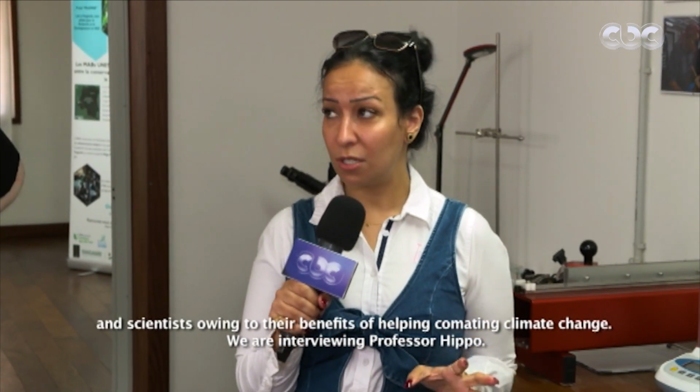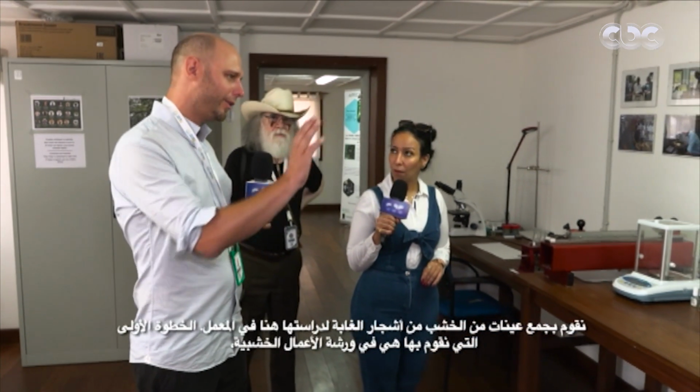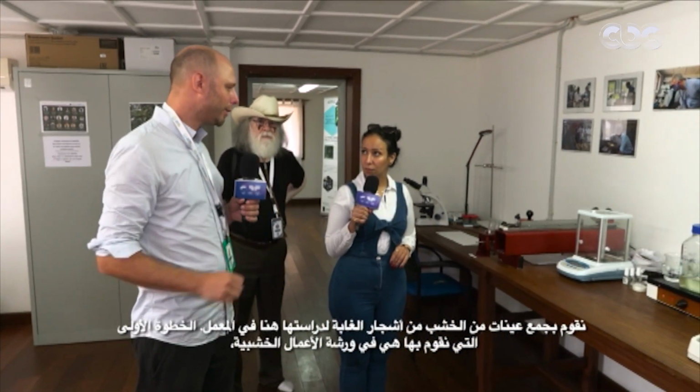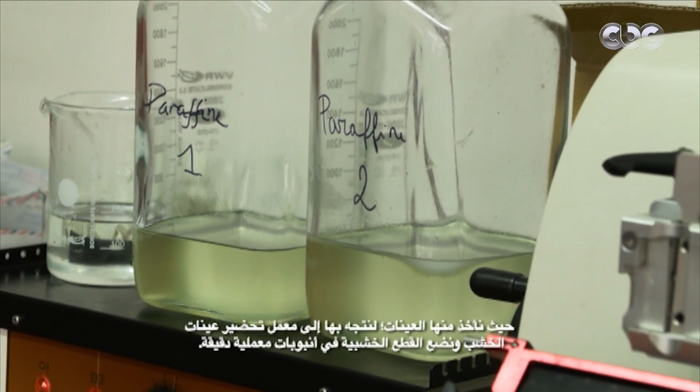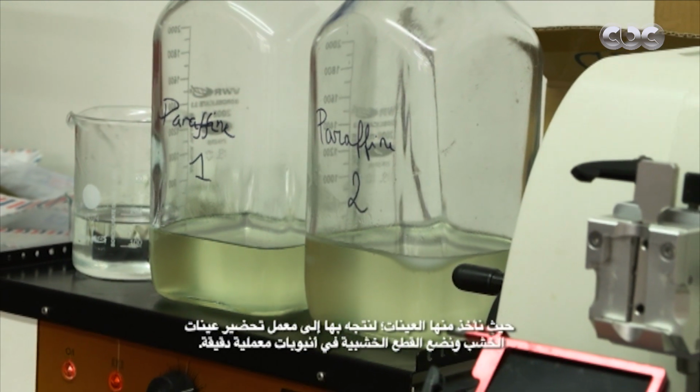Welcome to our program Zoom Africa. Thank you very much. So we will start from here, right? Yes. So can you explain what that is? So what we do is we take samples of wood from the forest to study here in the lab. The first step that we do is next door in the woodworking workshop. We take small samples, we take them in here. This lab is the wood preparation lab, the sample preparation lab.